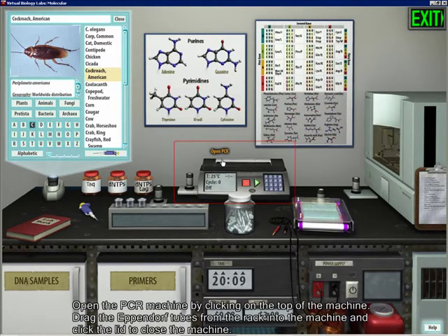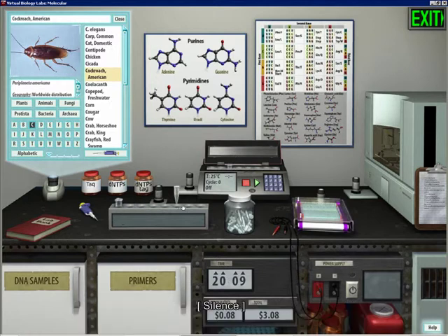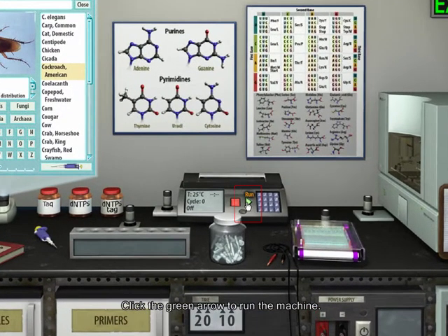Open the PCR machine by clicking on the top of the machine. Drag the Eppendorf tubes from the rack into the machine and click the lid to close the machine. Click the green arrow to run the machine.